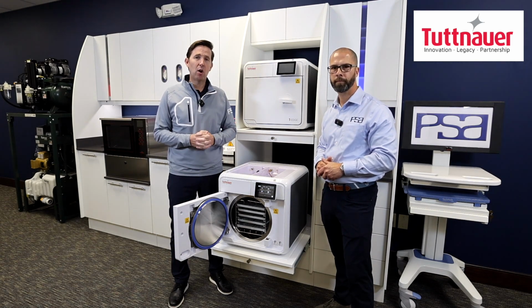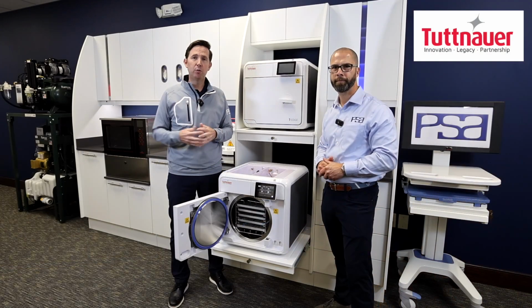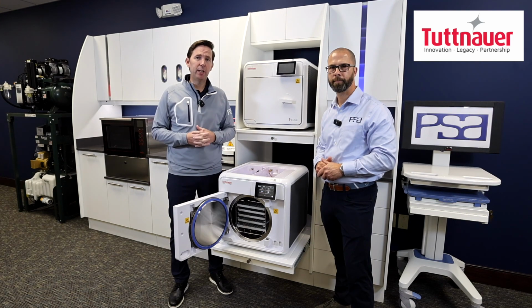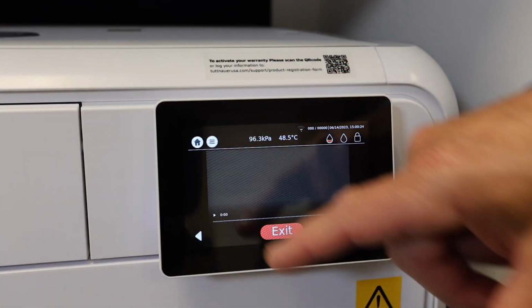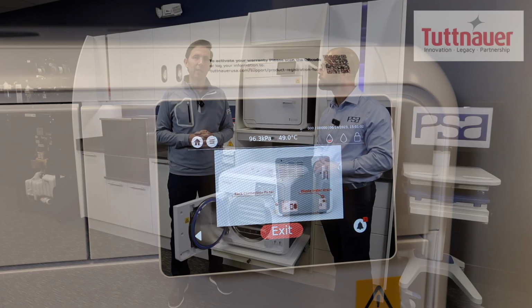It even has a feature on there with a QR code that they can use to link them to a YouTube video to see some different training videos. We do have the capability of watching that video on the display screen, however, it just doesn't have that audio component, and so that's why we would suggest to go to YouTube to get that training video.